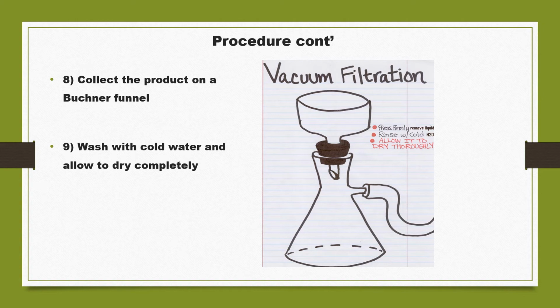In that way it will filter out the samples and make them dry in a cold environment.